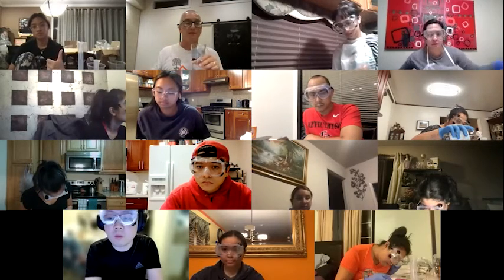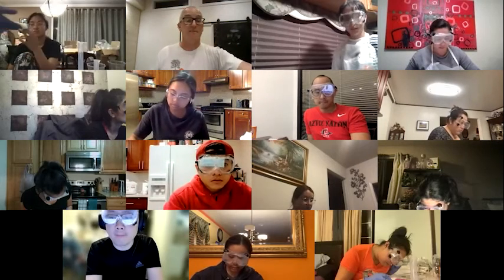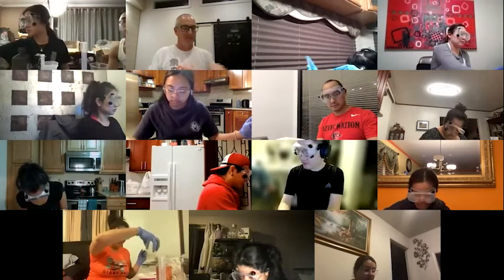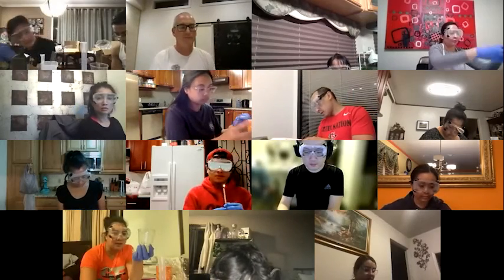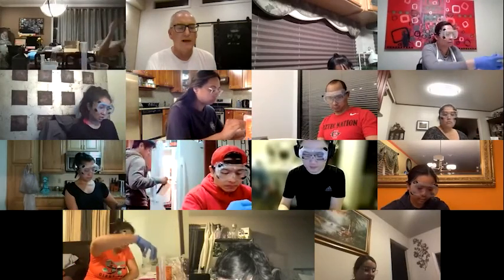All right. So how's the experiment going? Ooh, I should check my milkiness. Yeah, it really helps if you let the gas accumulate under there and then pop the flaming splint. So is there also a change in the solution too? Because it looks different now. I don't know if that did anything or if it was just because I added more. Did it go clear? No, it just looks like there's more precipitate.